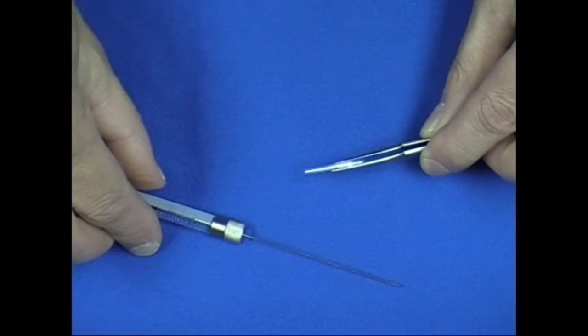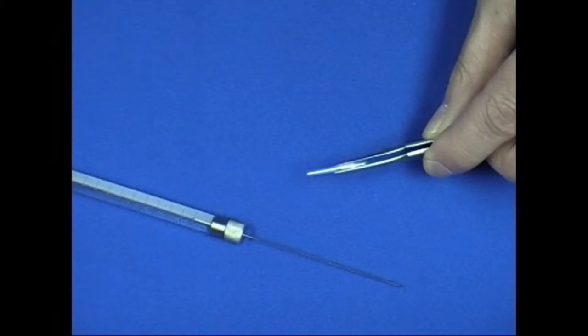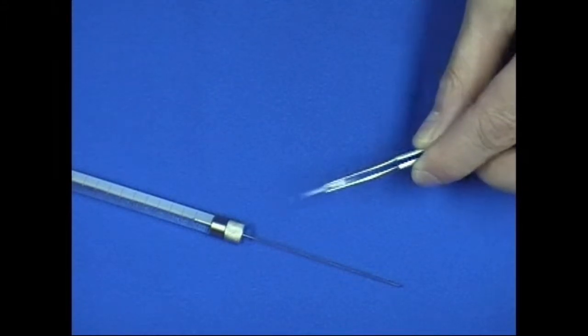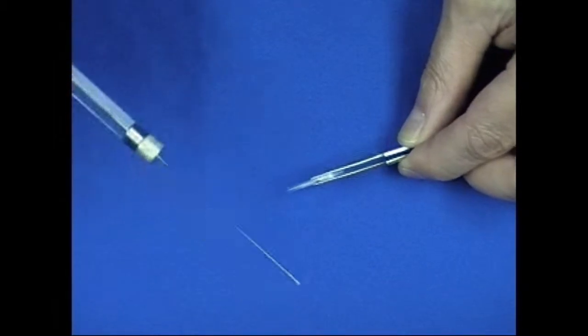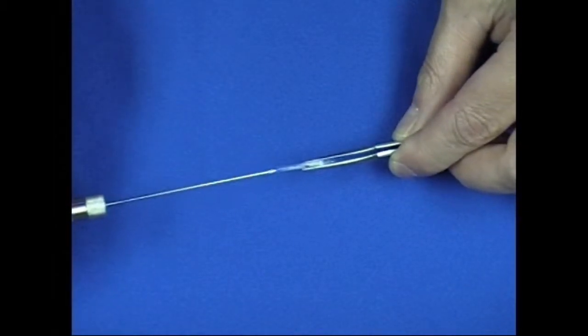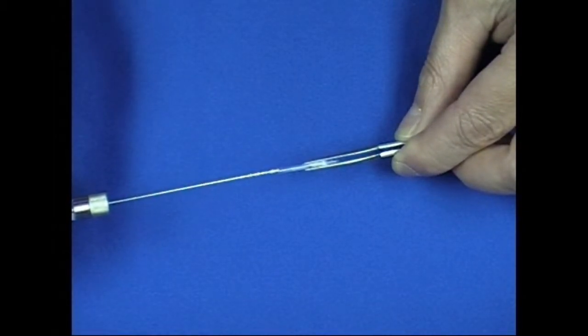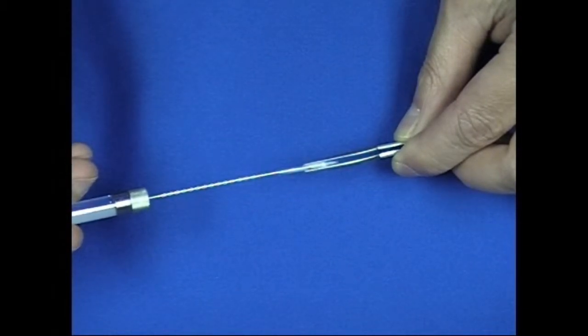The standard coil pyroprobe can be used for liquid samples, either viscous liquids or solutions, by taking a quartz tube, filling it with quartz wool, and then using a microliter syringe to put the sample down inside the quartz tube where the quartz wool is.